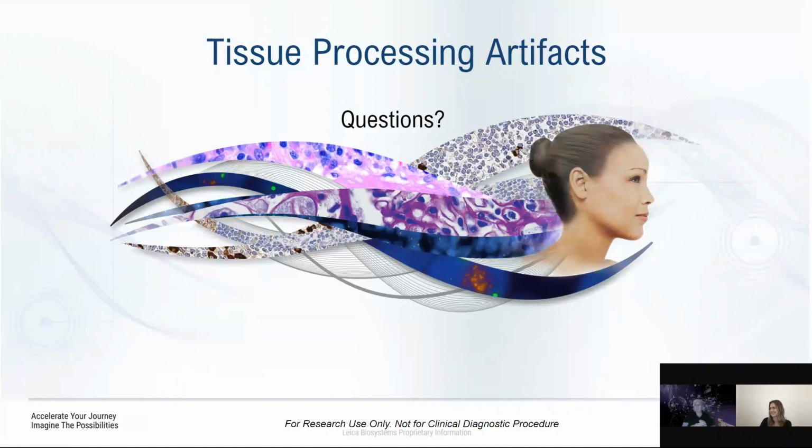Absolutely. All right, now what is the correct slide thickness, or what should that be? Correct slide thickness or section thickness? Maybe they meant section of the tissue? Maybe the section. When you're grossing, right?